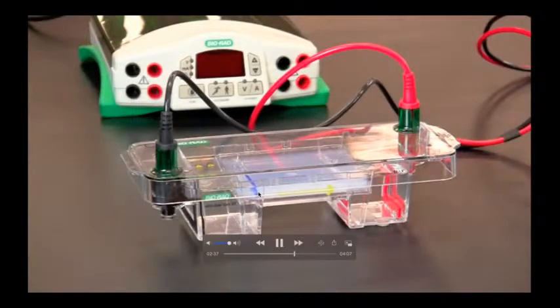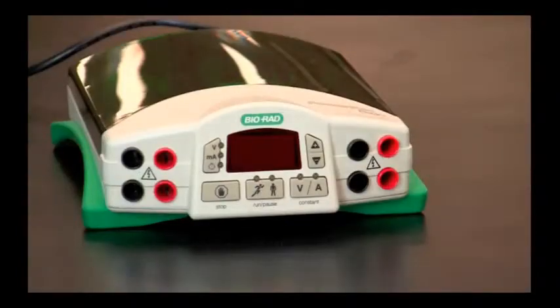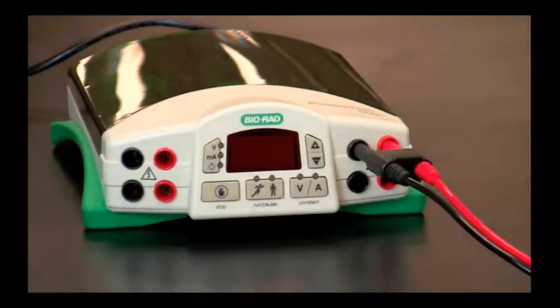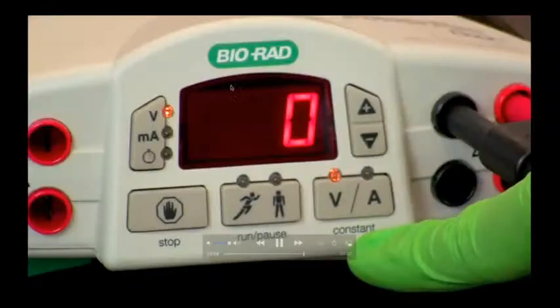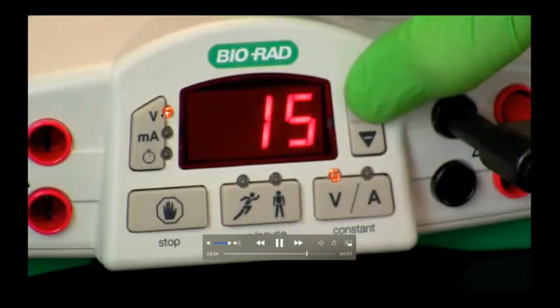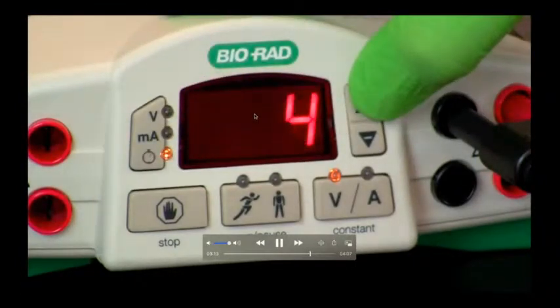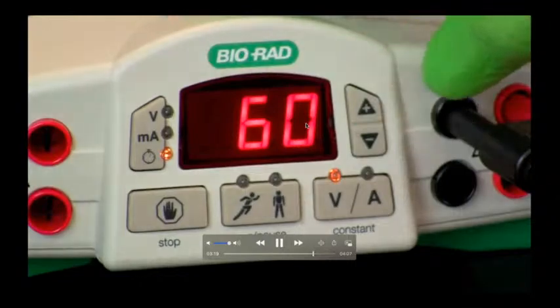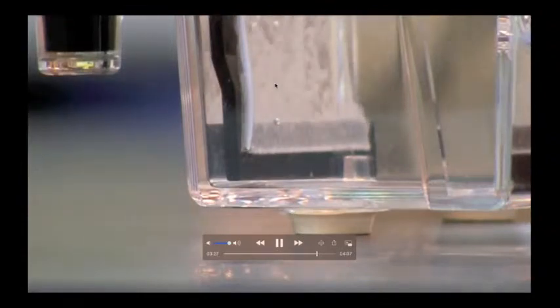So we will run it at some voltage. Turn on the machine. Make sure you have set the voltage, then set it to 100 volts, and you put the time for, I guess, 60 minutes, for 1 hour. Then you press the run button. You see, it started. Your gel starts to run.